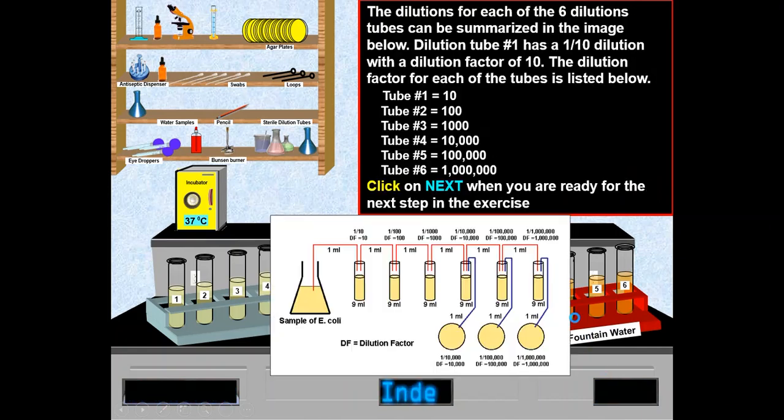Okay, click on next. The dilution for each of the 6 dilution tubes can be summarized in the image below. Next.